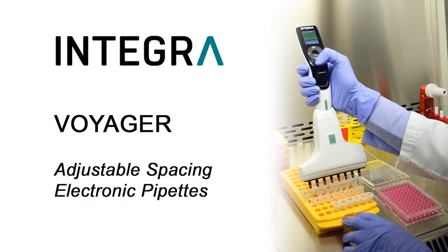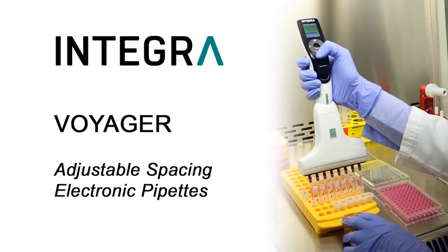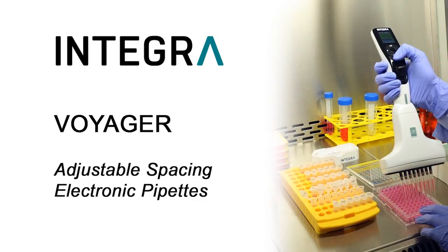Welcome to the Integra Voyager Pipettes, the only pipettes with electronically adjustable tip spacing.